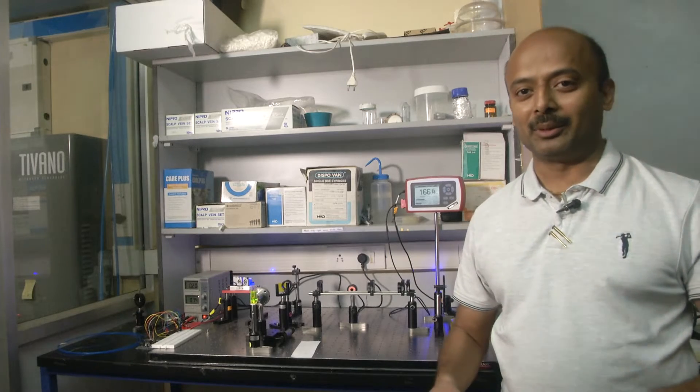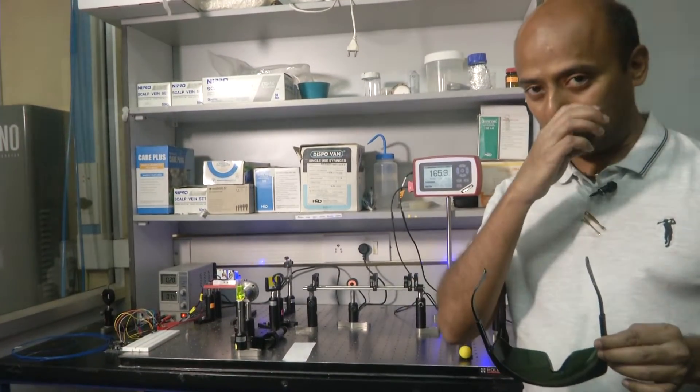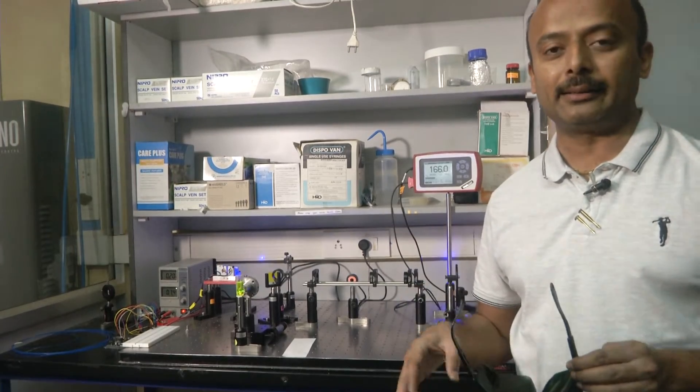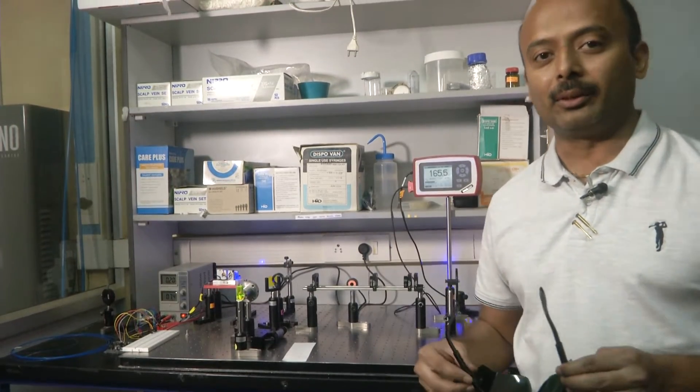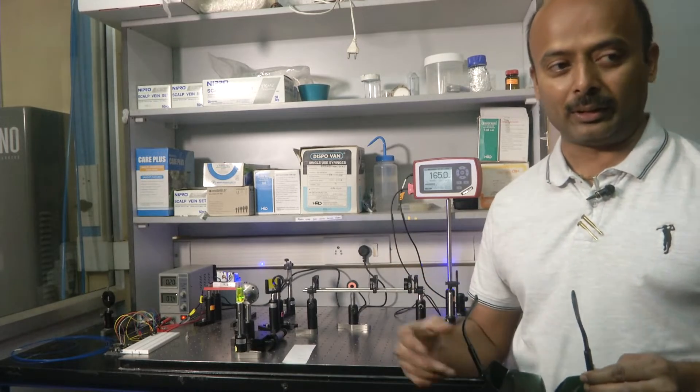Hello and welcome to the next lab session on the optical spectroscopy and microscopy course. We saw so far about how to align the laser, how to get the laser light into the fiber optic device or an optical fiber.